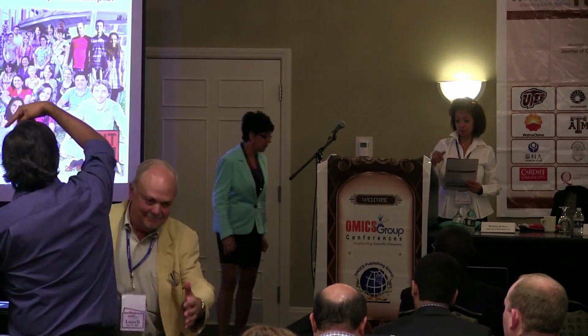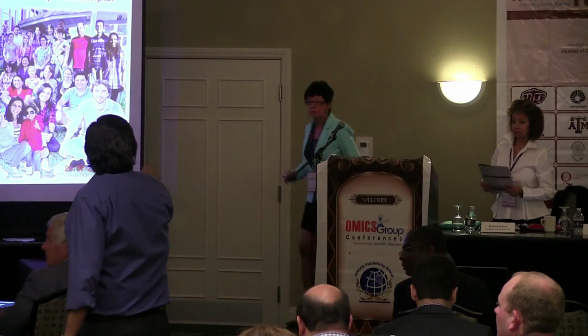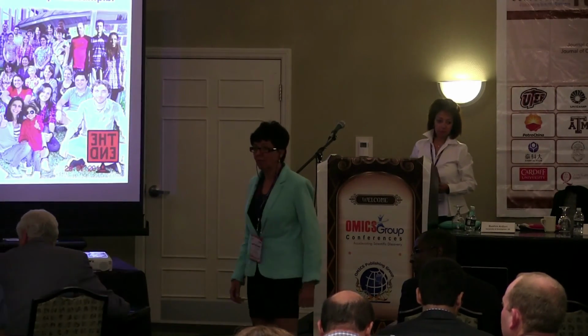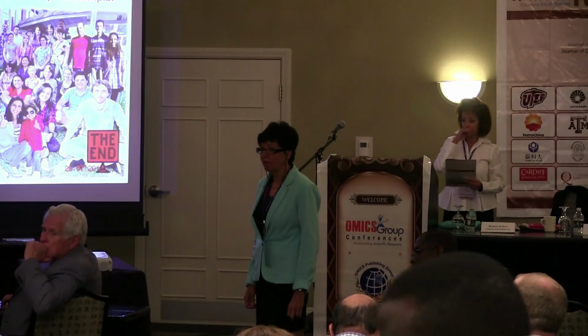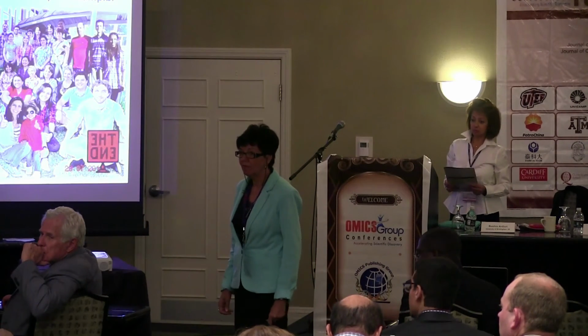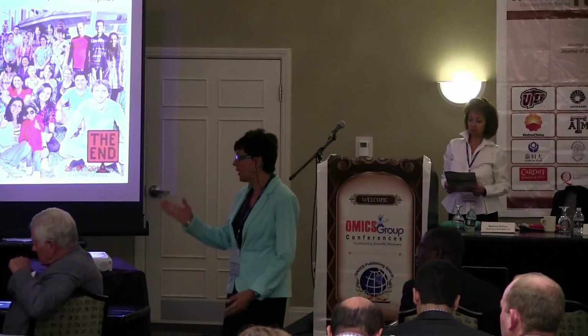Okay, Dr. Jones. Yeah, this question is stimulated by the previous question. I think the point being made was that only quite a small proportion of the material is so analysed. And I thought of an analogy with work on coal tars by MS GC, where 15 to 20% of the coal tar is ever analysed. The rest just lodges in the capillary column, in the chromatography column. So it's an analogous difficulty. Yes, yes.